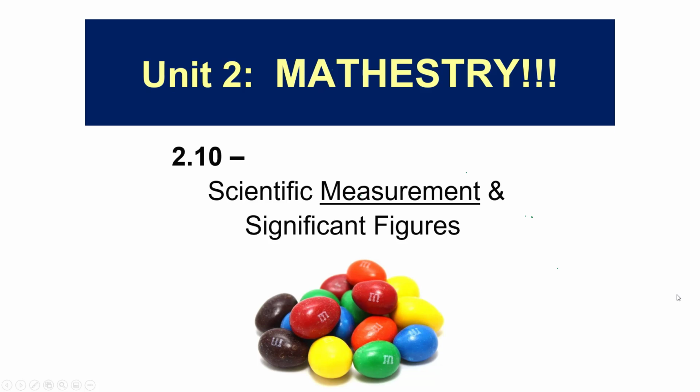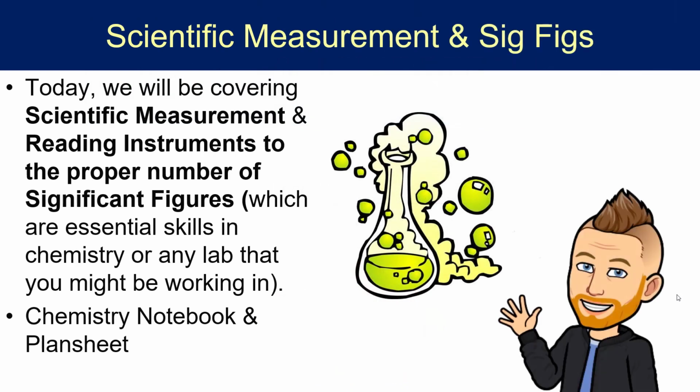Welcome to this video in the Mathistry unit. This is 2.10, and in today's video we're going to be covering scientific measurement and how to read instruments and measuring tools to the proper number of significant figures, which I have to tell you is an essential skill in our chemistry class, or really any lab that you might find yourself working in the future.